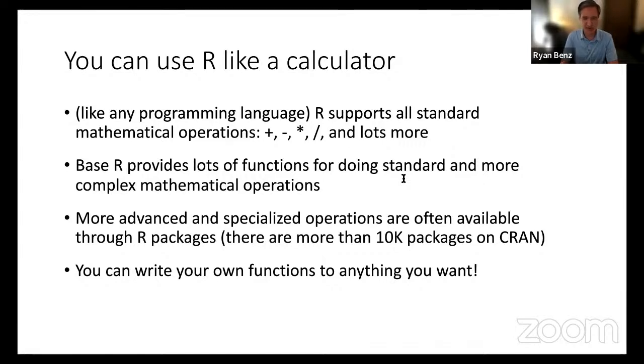There are also specialized packages out there that you can download and install. In fact, we're going to hear about amazing packages here as part of the main institute that Olga and her team developed, MSStats, for example, that are powerful add-ons to R that provide additional features. And just to give you an example, there are repositories where these official packages live. One of those is known as CRAN, another is Bioconductor, which Olga mentioned.